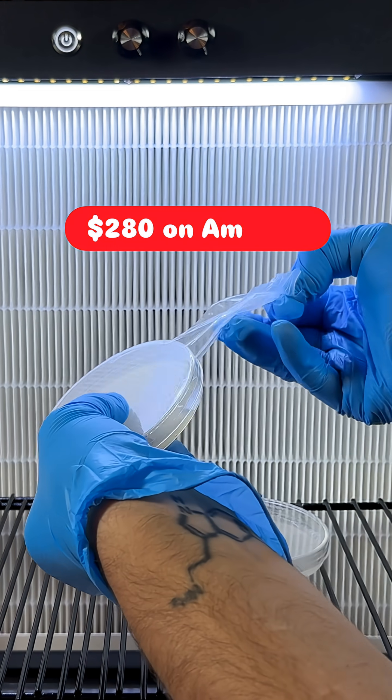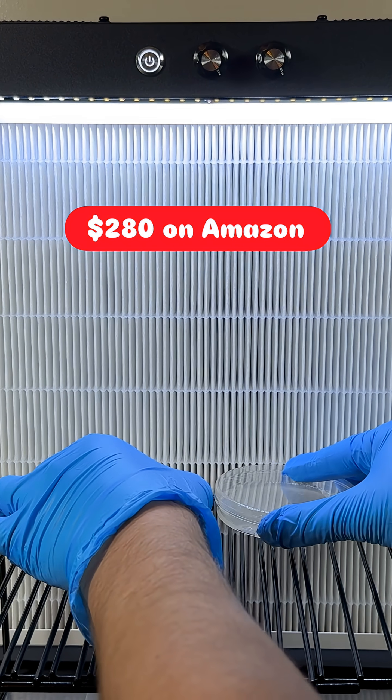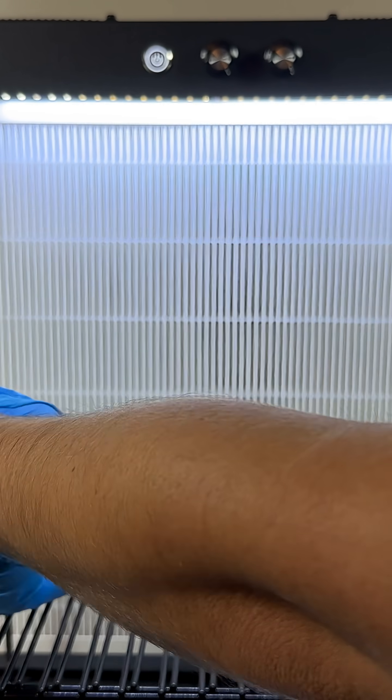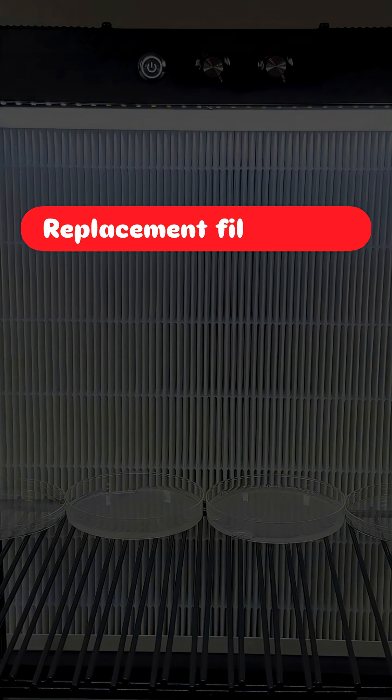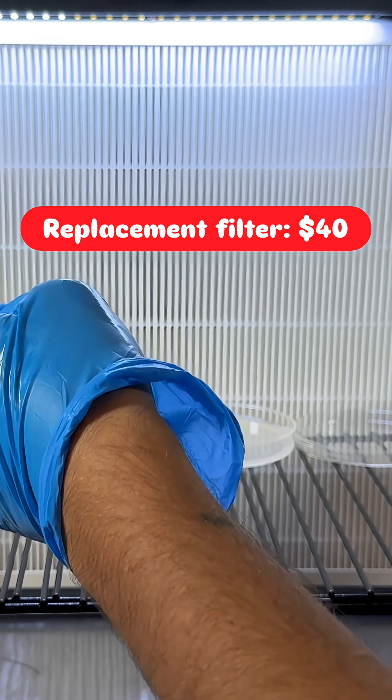The flow hood is priced competitively at $280 on Amazon and you can get 5% off by using the code Spore and Sprout. Replacement filters cost about $40 and I recommend swapping them out every six months depending on usage.